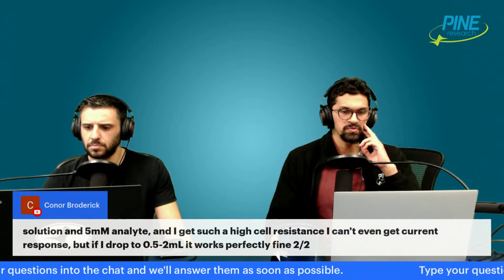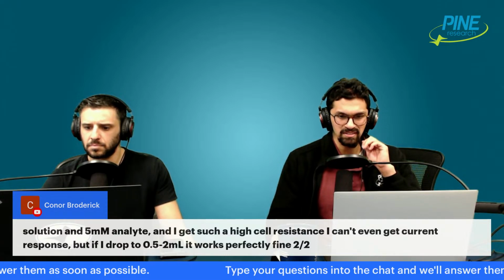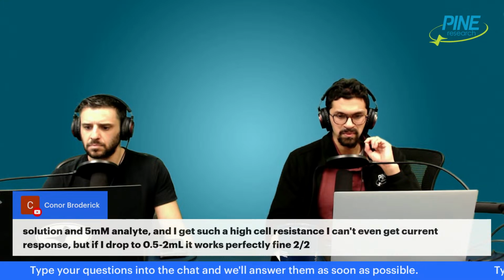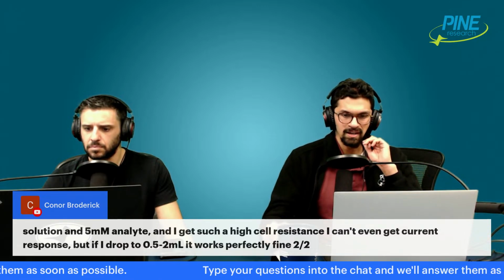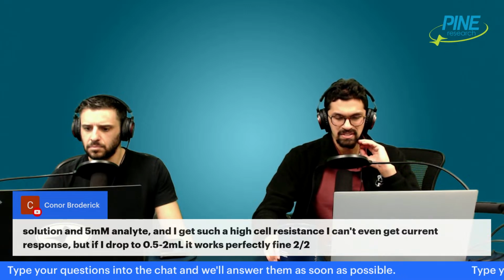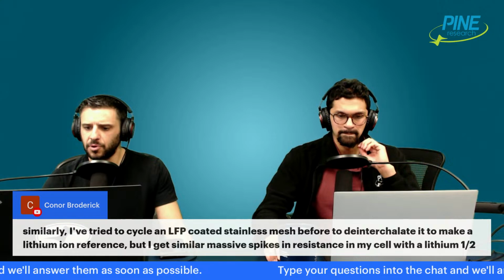So the fact that you go from 0.5 to 2 milliliters makes me feel like there's something going on in the cell. When you change the cell volume, the cell geometry is changing in some way. That's kind of my answer without any more information. I don't know if there was anything else, a follow-up that he put a little later.